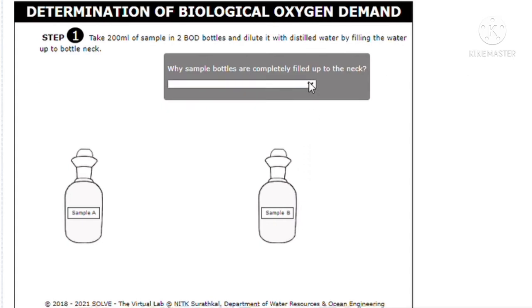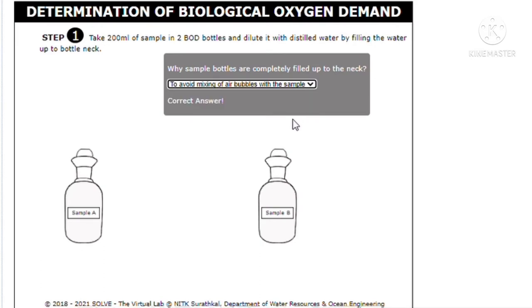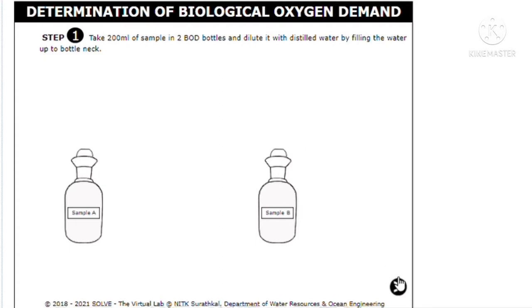The question is, why are sample bottles completely filled up to the neck? I would say to avoid mixing of air bubbles with the sample.